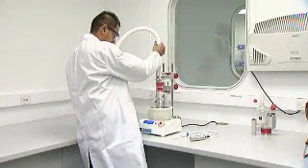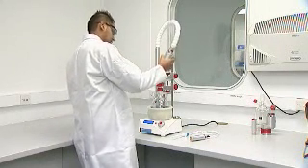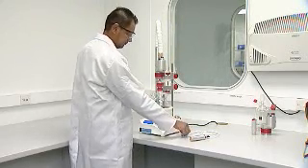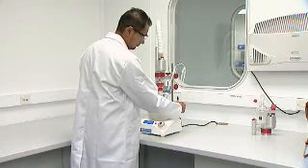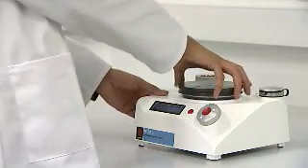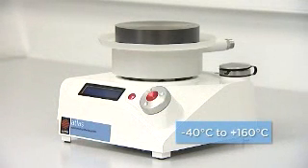Easy plug-in upgrades include the Scorpion overhead stirrer for viscous solutions or large quantities of solids, and an in-reaction temperature probe. The Atlas hot plate can also be substituted for a hot and cold plate, with the heating and cooling circulator controlled by the base.